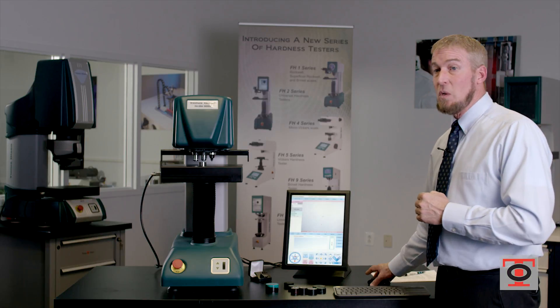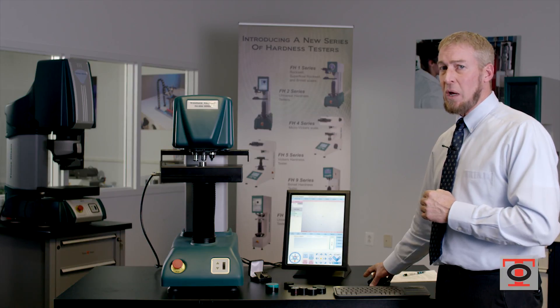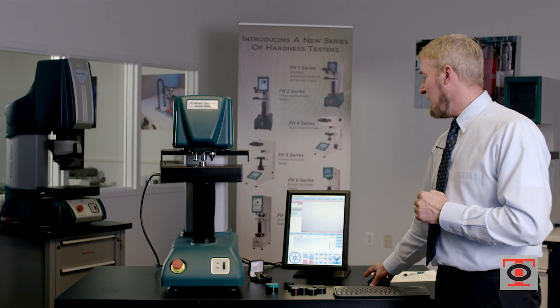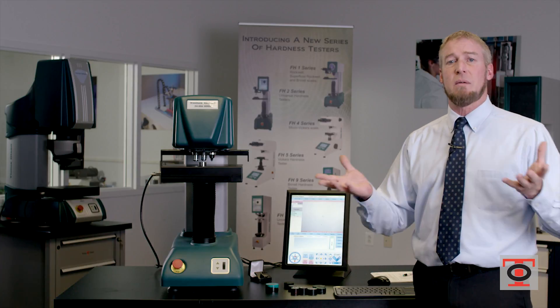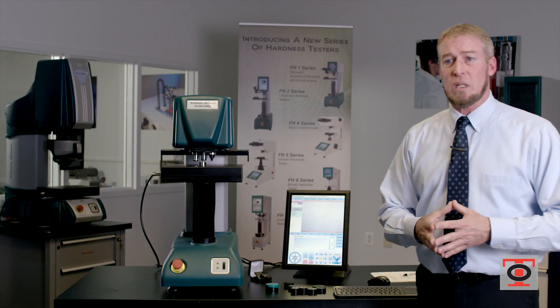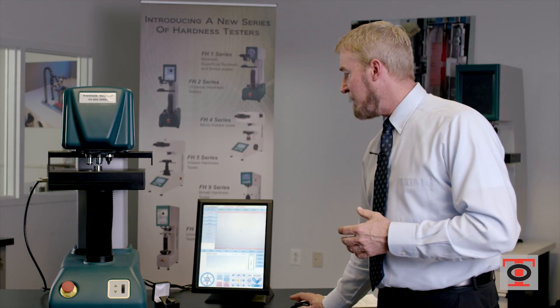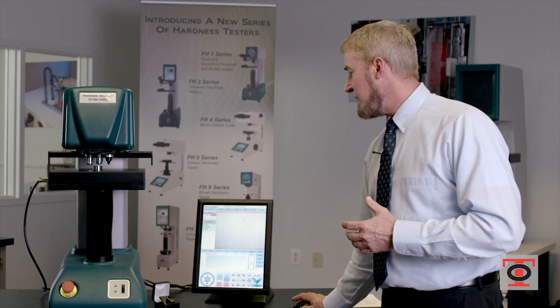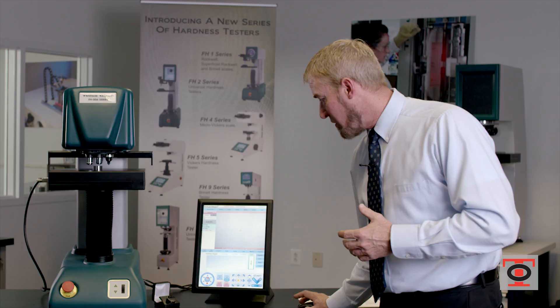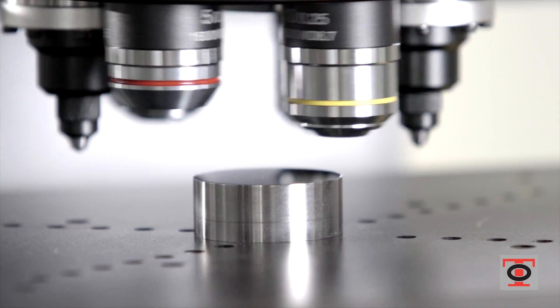We're going to set up a simple one Vickers test on a sample, just to show you how easy the software is to set up. We're going to use five kilogram force as the test parameters and a dwell time of 10 seconds. I've already put my sample in the machine and focused it. So now what I'm going to do is select my test from the drop-down list at the top — I pick my Vickers five kilogram test. The objective I'm going to use is a 10 power objective, so I select that.